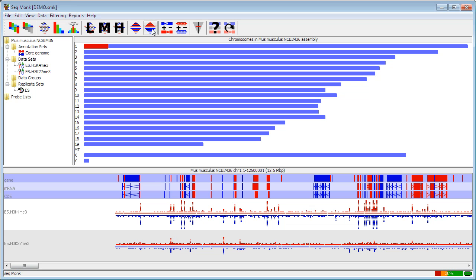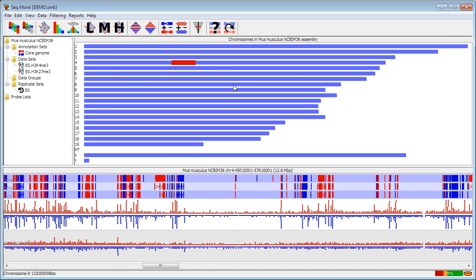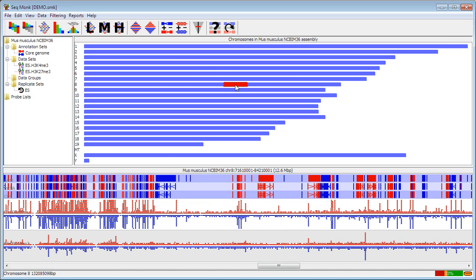Moving around in SeekMonk is fairly straightforward. You can do this in a number of ways. You can click anywhere within the genome view to jump to a new chromosome and a new position to see different parts.